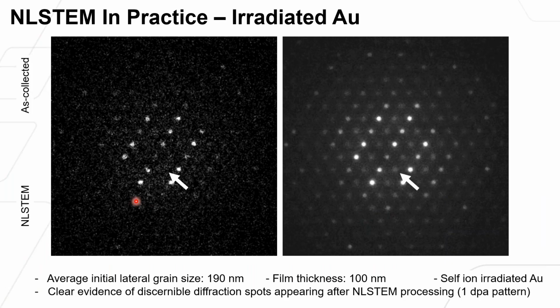As you irradiate the samples, you're going to add curvature locally to your microstructure, to your crystal structure. And what that gives you is essentially an inverted precession electron diffraction effect. So with precession electron diffraction, you're rotating your electron beam at a fixed angle, collecting signal from kind of a wedge in reciprocal space. Here, we're not rotating the electron beam, but the crystal rotates. So as we collect diffraction patterns over an area, we get this averaging over a range of crystal orientations, and we get essentially a precession electron diffraction effect. So that's why we think we're actually getting higher indexing rates as we go to a more damaged film.